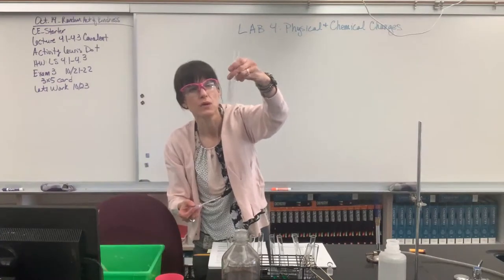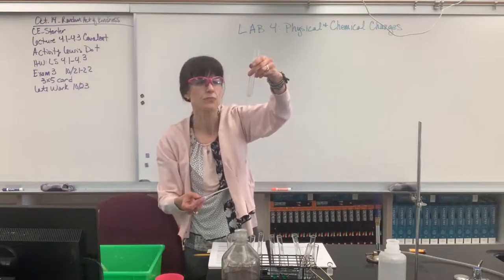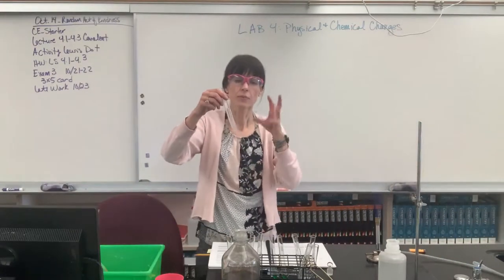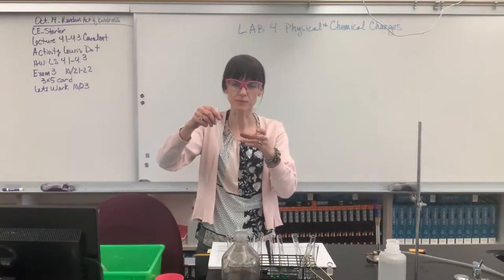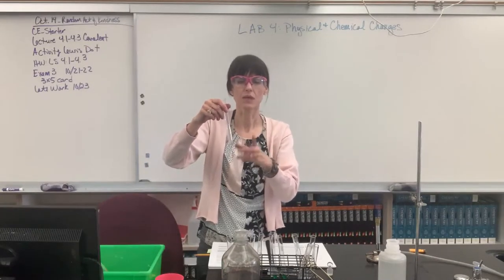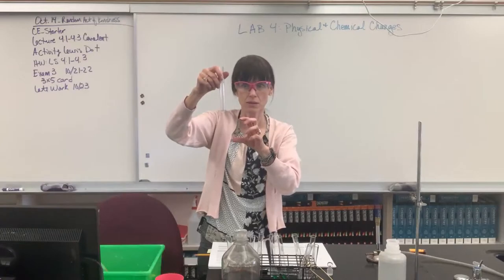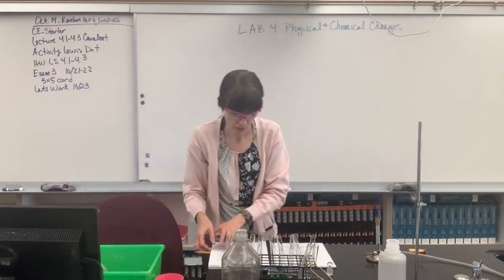Nice. Now there is a difference between this one and the other one. Very interesting. Kind of fun that you can see this. So the other one, when I put the HCl in with the magnesium ribbon, the metal, it evolved gas, but the liquid was clear. This one, it evolved gas, but the liquid is a cloudy white. So the end liquid is a little bit different. Let's record both of those.